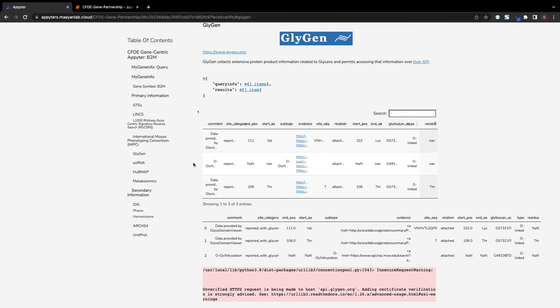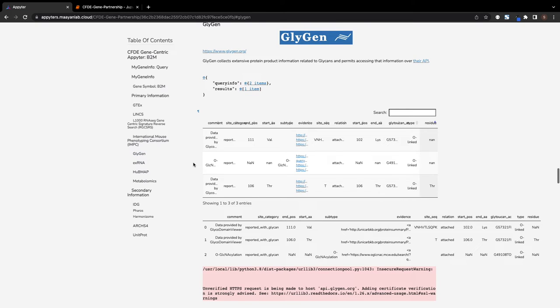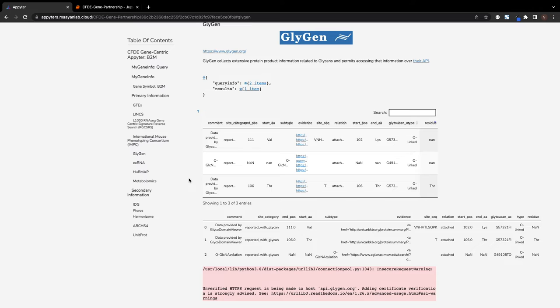Additionally, the Glygen API provides glycosylation data for the gene from a database containing glycoscience-related knowledge retrieved from multiple literature and website sources.